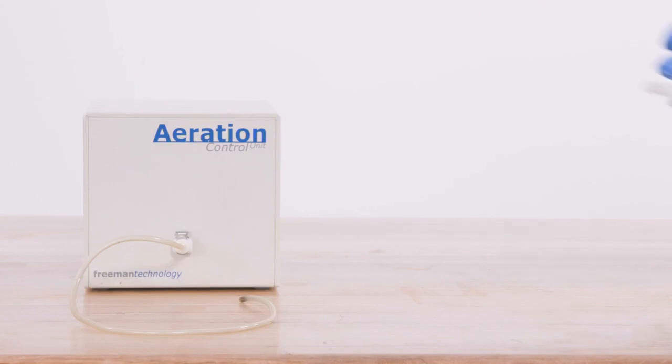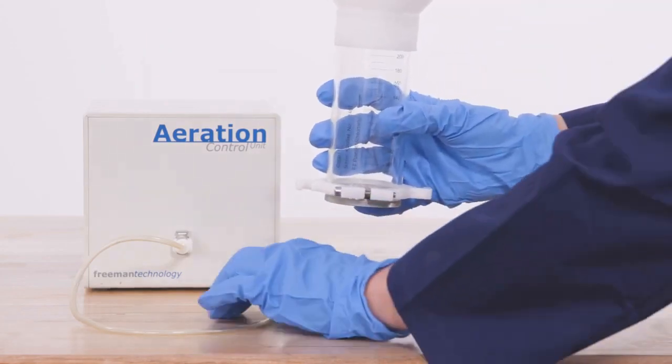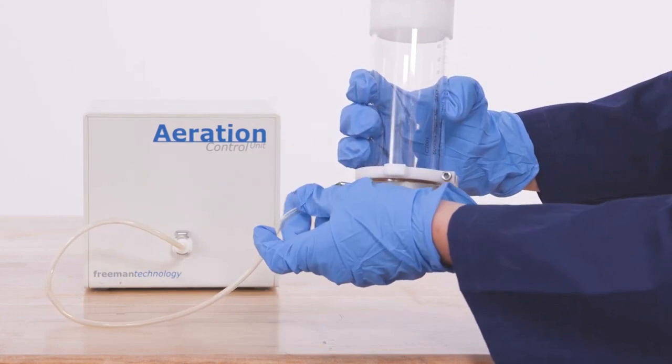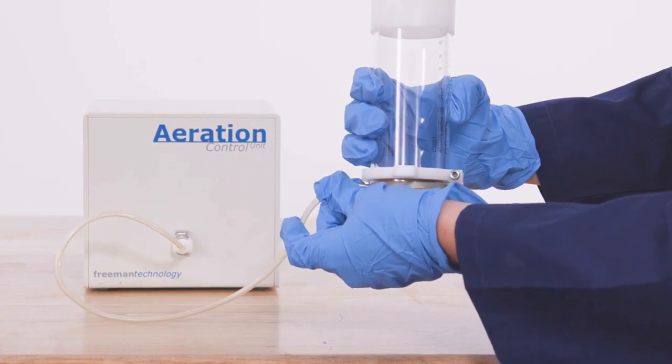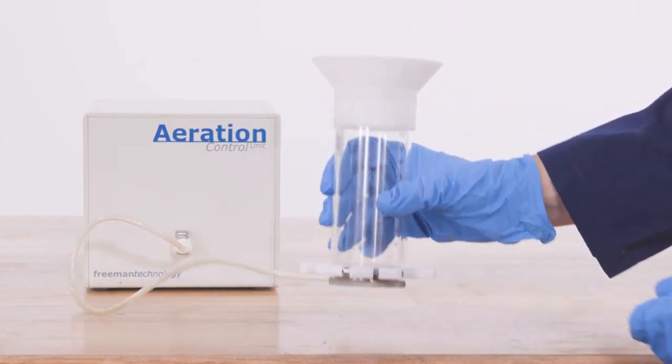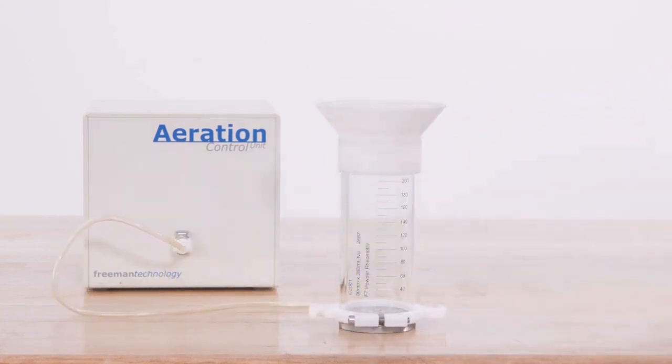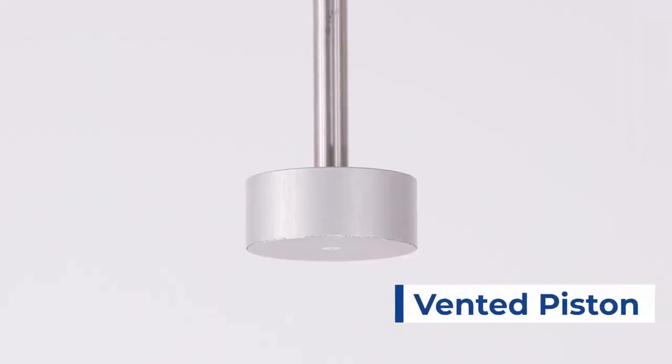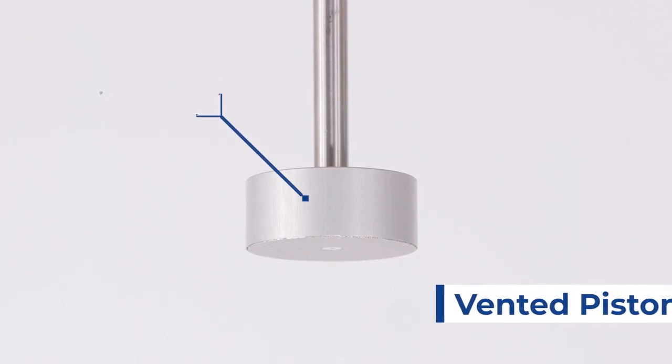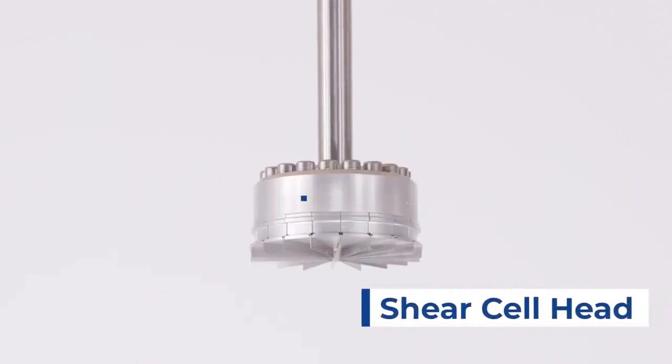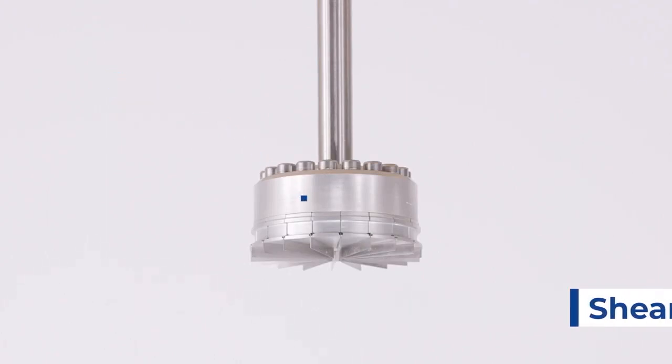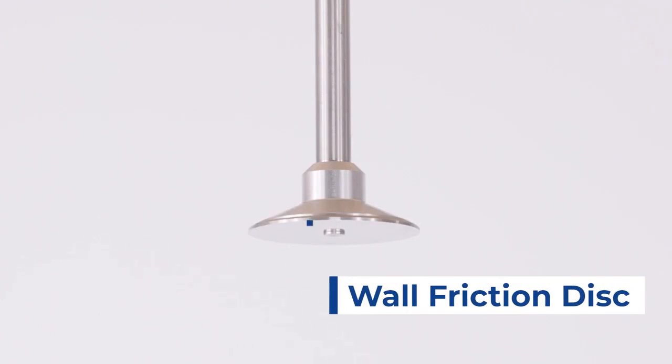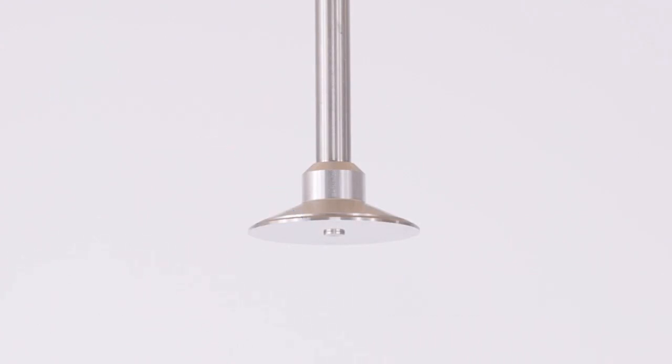One of these additional tests we can perform with the FT4 is the aeration test. This test will use the aeration control unit as well as a special vented base which connects to the ACU. Additionally, we have different spindle accessories such as the vented piston which we will use for compacting the powder, the shear cell head which we will use to perform shear testing and characterize particle-to-particle interactions under a high-stress environment, and the wall friction disc which we will use to characterize the frictional interaction between the particles and the equipment wall.